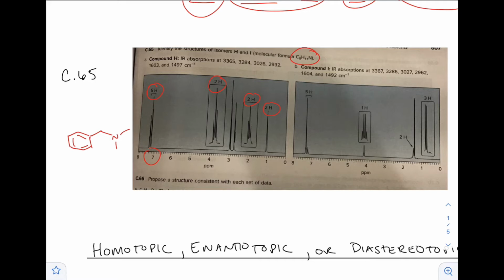Oh, you know what? Here we go. Let's do that, because that has to be 2 hydrogens, that has to be 2 hydrogens, that has to be 2 hydrogens. Oh, yeah. Let's check the IR actually. NMR is super helpful for me, and that's usually what I focus on first, but does everything make sense?